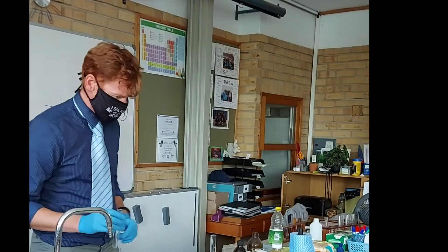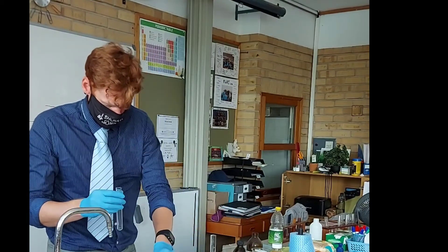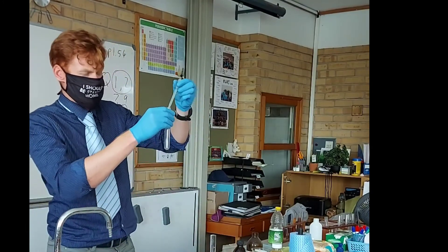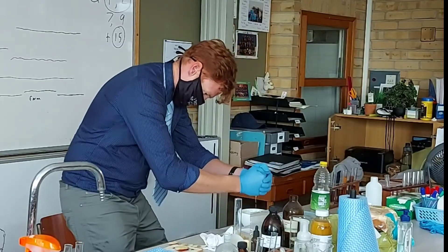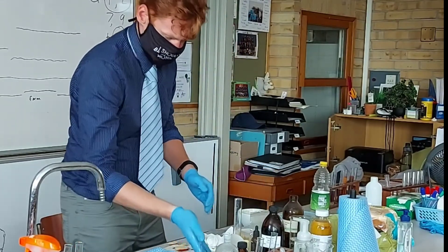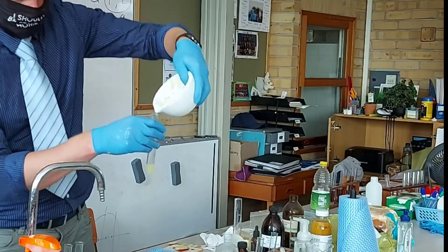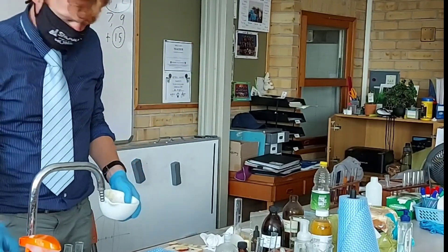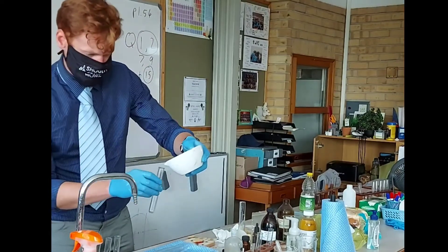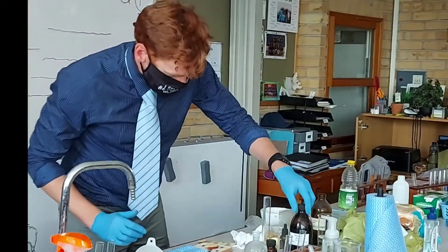For the control on this one, I'm going to take egg white — the protein — just to show you. Then we squeeze the apple juice here. Apple juice. And then we've got tomato.